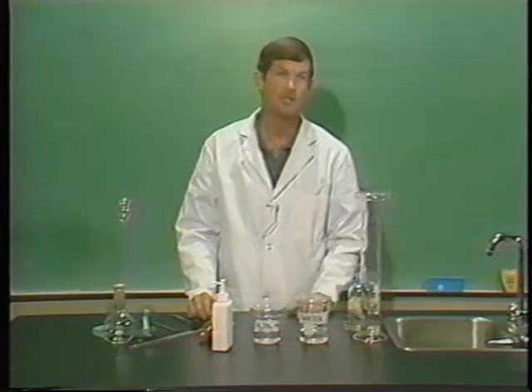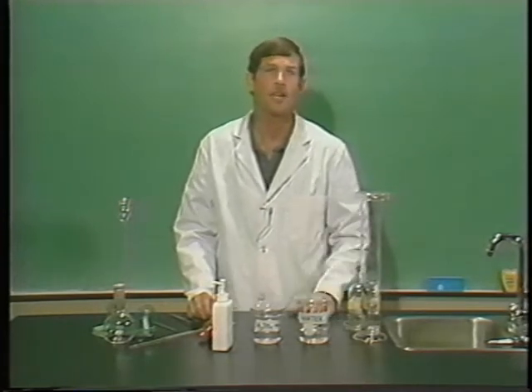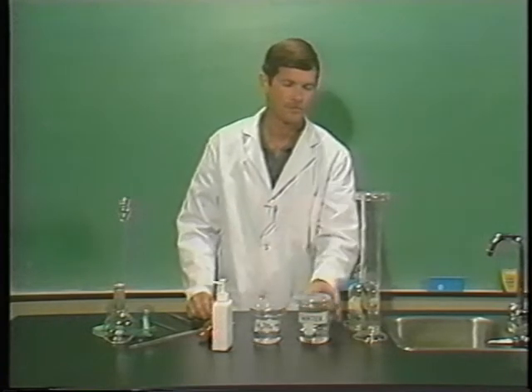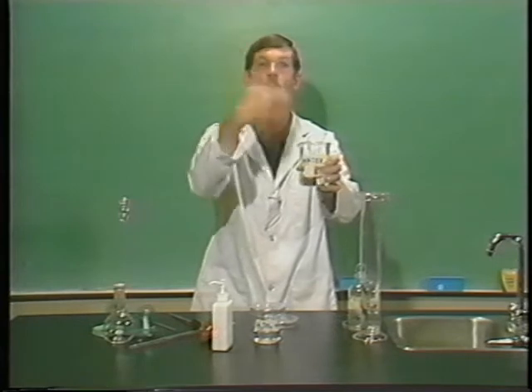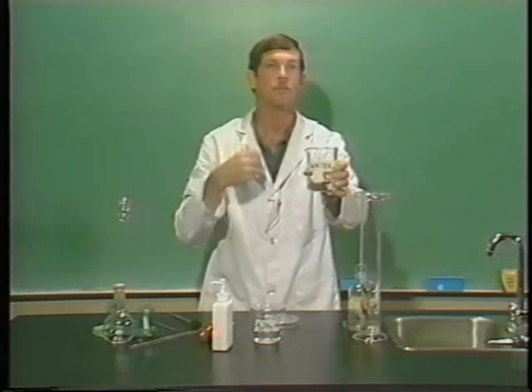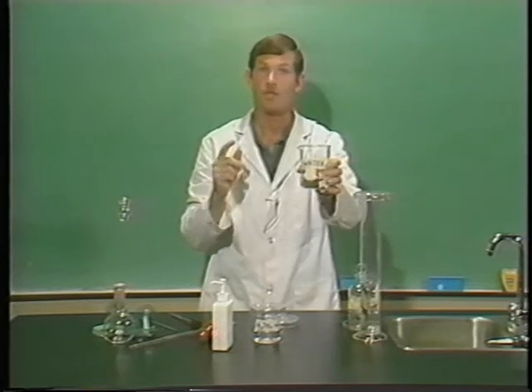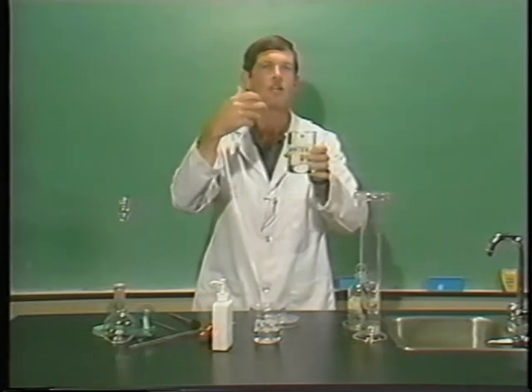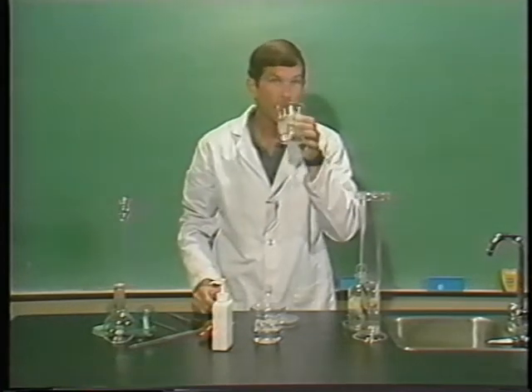Sometimes we may have to smell a chemical. It may be an instruction in the handout sheet, or we may just have to find out what it is. There's a proper technique to do this. First, hold the chemical about an arm's length away and wave your hand over the top. Try and carry some of the vapors toward your nose. See if you can tell what it is. If you can't, move it a little bit closer and repeat the process. Continue to repeat the process until you can either find out what it is or find out that it has no odor.